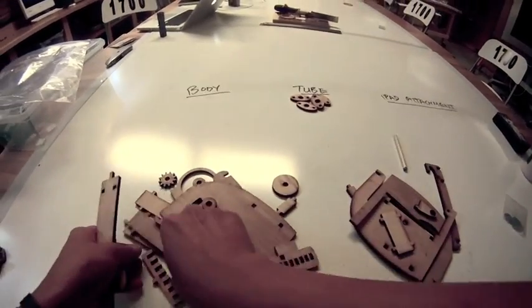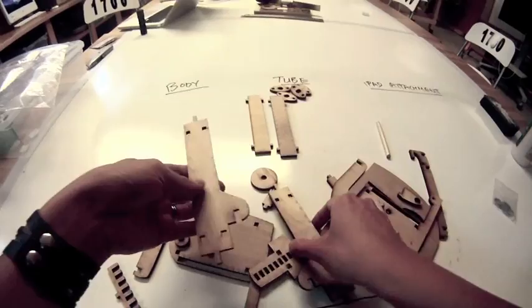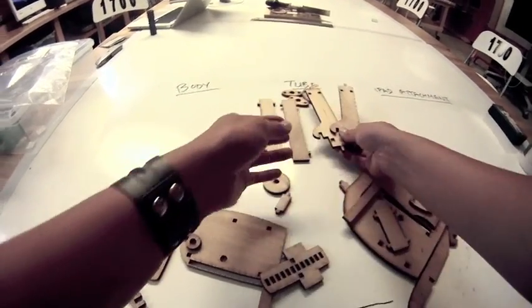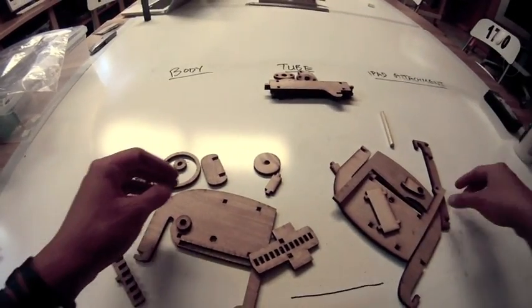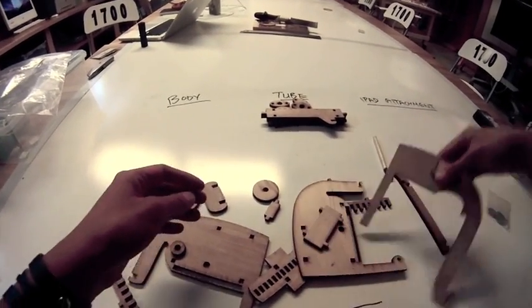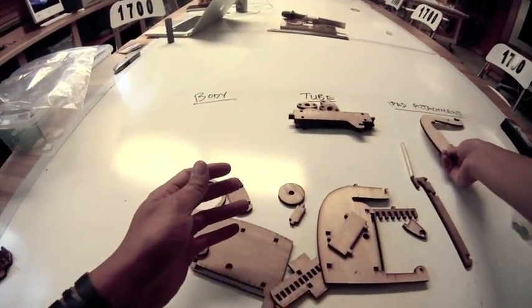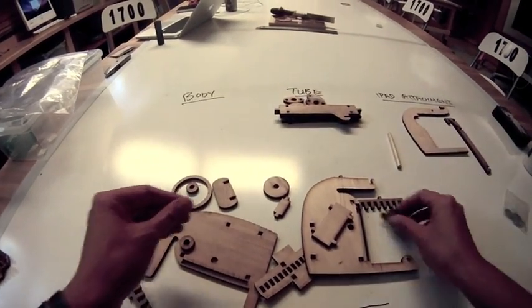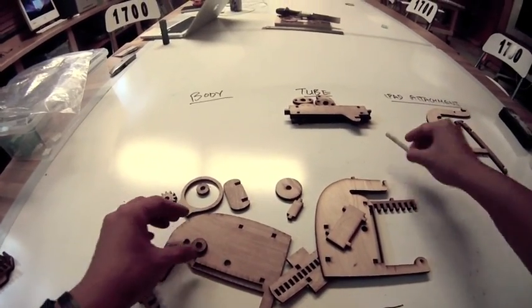There are also four long pieces. Two of them look like this, and two of them look like this — with a little curved kind of finger on them. Those belong to the microscope tube. Also look for a part that looks like a big U shape — that belongs to the iPad attachment — along with this little skinny piece and this tiny piece with a hole in the middle. Those we're not going to use.